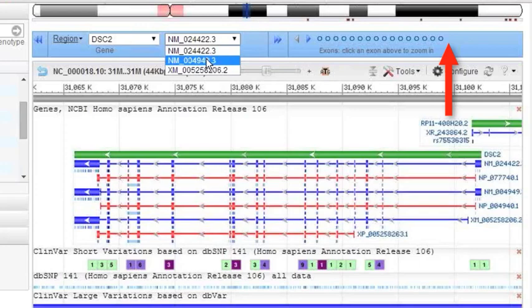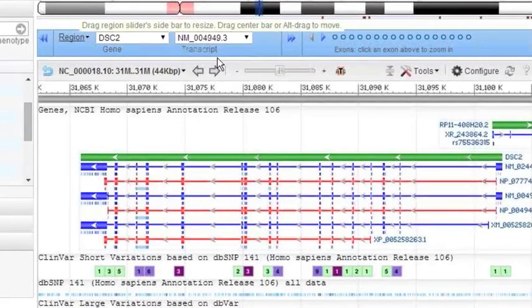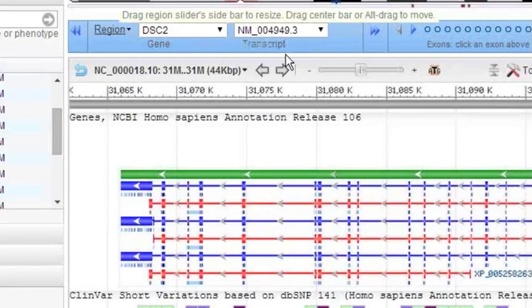What you'll notice is that it will actually change because I'm going to add an exon when I do that. So you'll notice it was a little subtle, but actually it added an exon. You may not be able to see it very clearly, but if you look at that second transcript, there's actually a small exon near the 3' end.